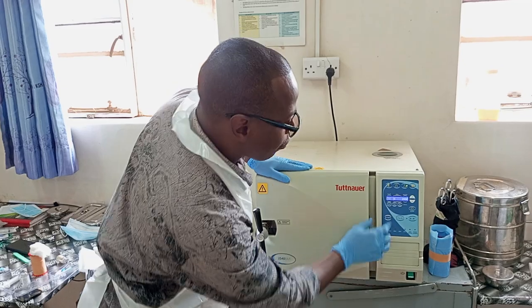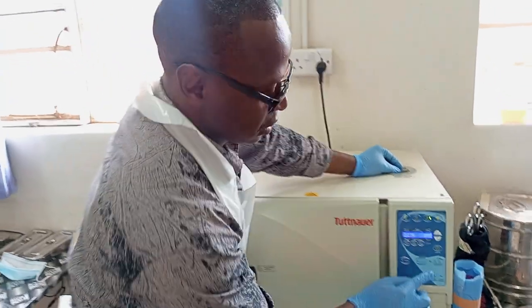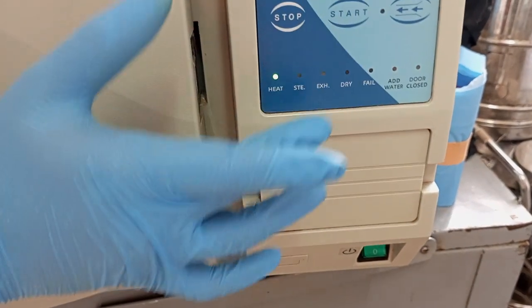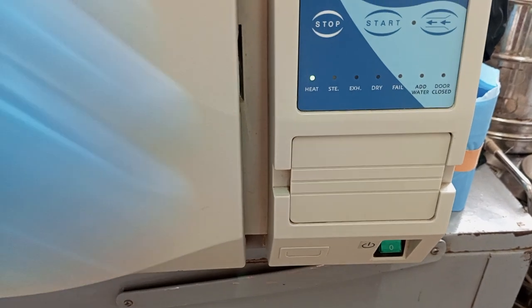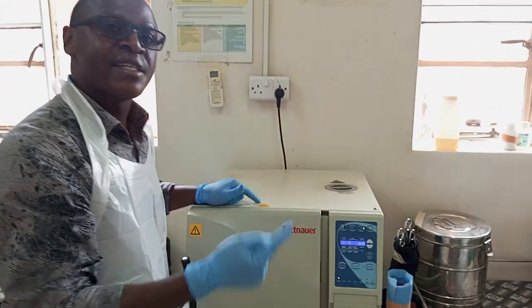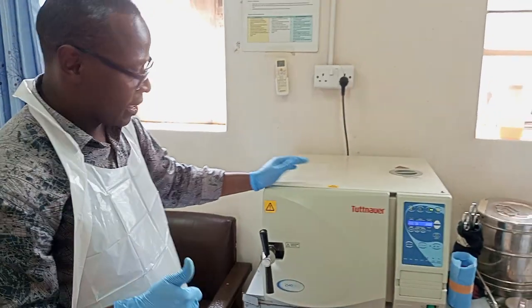Okay? So, again, if you forgot to inspect the water levels before starting the machine, you will find that once you pack everything and start the button, the water level is likely to be low. The machine will give you a hissing sound and a red light. It has a very powerful memory. So you just check on the dashboard, you realize, add water. Instantly follow the instructions from the machine. Add some more water, start the machine again, and it will automatically click on and start running smoothly.